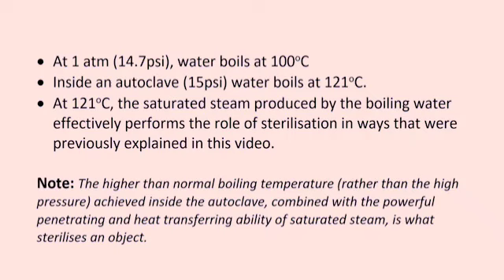At this temperature, the saturated steam produced by the boiling water effectively performs the role of sterilization in ways that were previously explained in this video. In this regard, it is also worth mentioning that it is not necessarily the high pressure achieved inside the autoclave, but rather the higher than normal boiling temperature achieved under such a pressurized environment, combined with the powerful penetrating and heat transferring ability of saturated steam, that kills organisms and sterilizes the objects inside an autoclave.